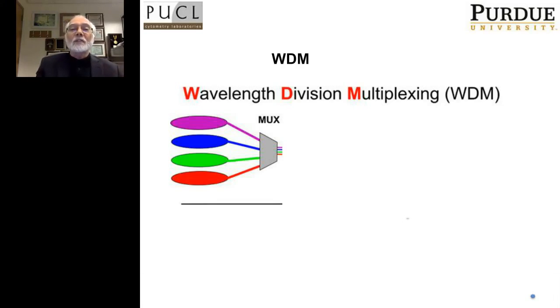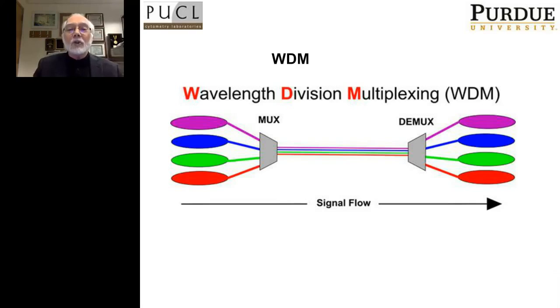Instead of calling it a transponder, I've used the term mux, and then they travel, in this case on a fiber optic, to a place where they're demuxed, or another transponder, and they're returned to their original wavelengths. So the question is, how does the CytoFLEX do this?